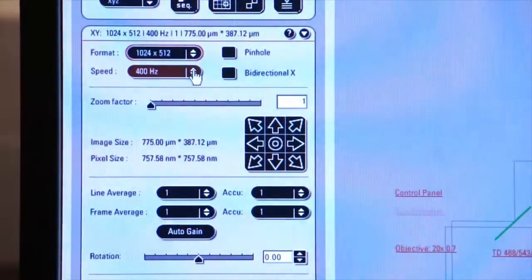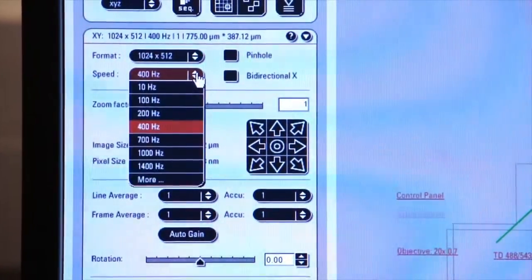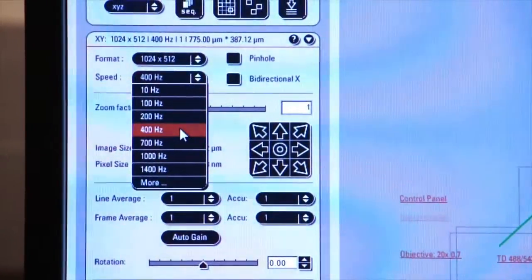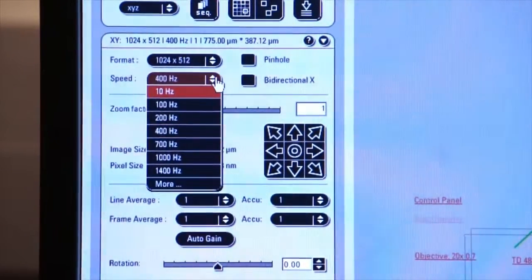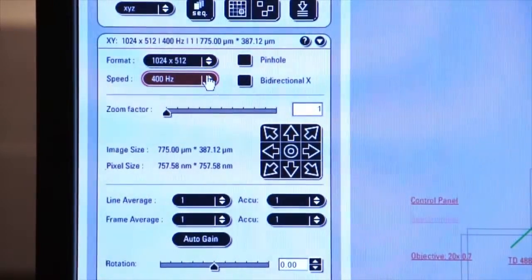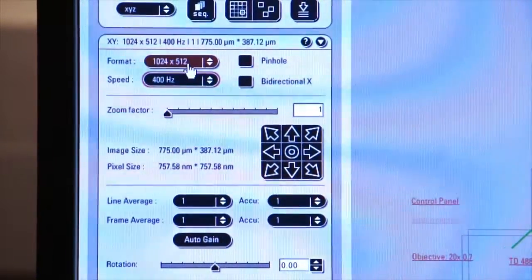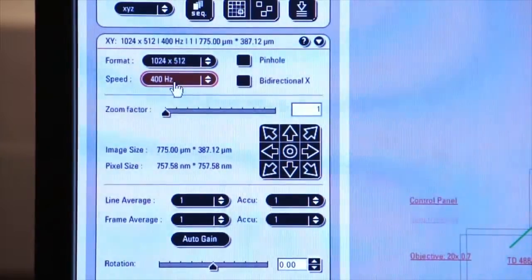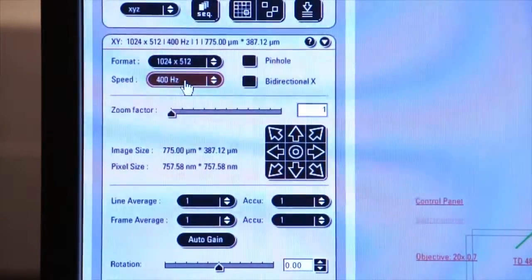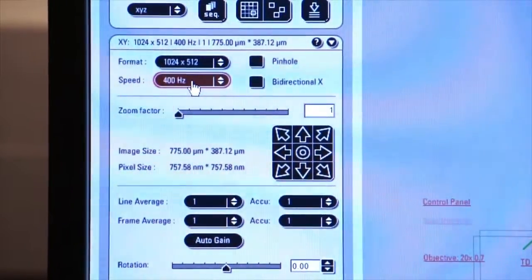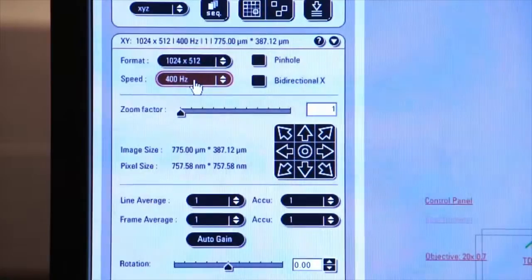The system also defaults to a speed of 400 hertz. For now, we'll leave it at 400 hertz. But as we increase in resolution, you'll see that we might want to increase the speed of the system to capture images faster and minimize photo bleaching.